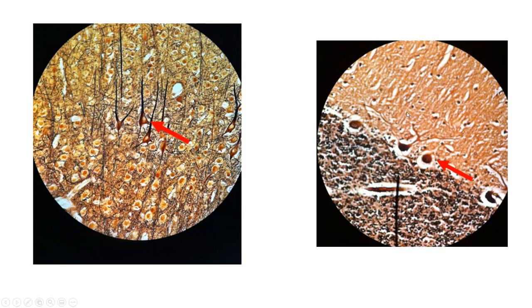Moving on, these are pyramidal cells. They look like little triangles—think pyramid. These are found in the cerebral cortex of the brain. If that doesn't make sense to you, it's fine for now because we'll cover the brain in the next chapter.